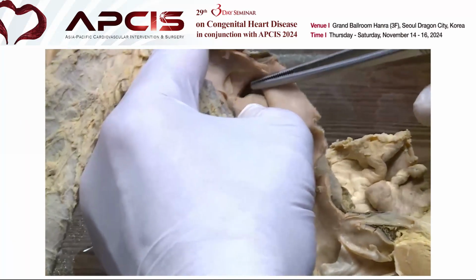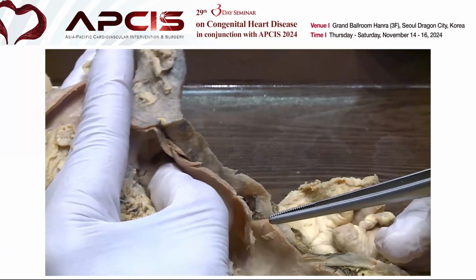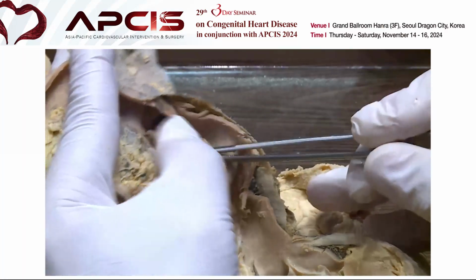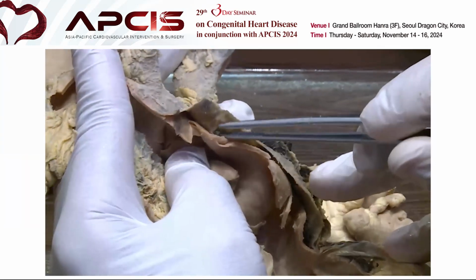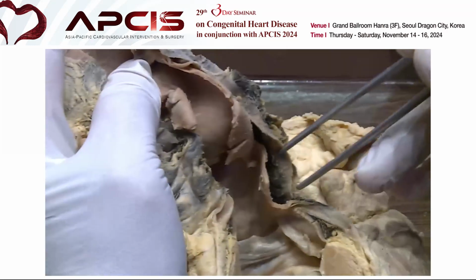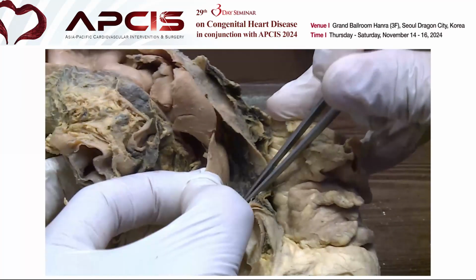This opening could be because degeneration of the media of the aortic wall was multifocal at the beginning, but with bleeding inside the degenerative focus in the media, a space could be produced, and then sudden rupture of the aorta could produce pressure into this space and make an extension to the descending aorta, arch, and ascending aorta, to the aortic valve. But at the aortic valve there is no more space for extension of the dissection, so it stops here.